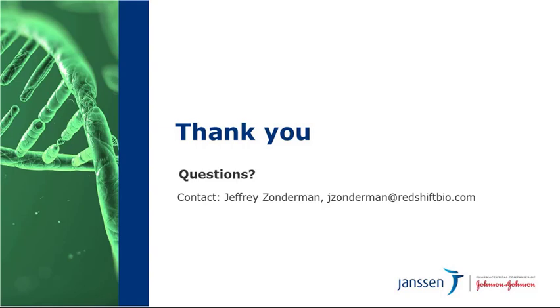Excellent. We have a question from Lou. Have you ever looked if the conformation changes reversed during the neutralization step? Very good question. That's actually the next step after this proof of concept study. So we're expecting delivery of our AQS 3 Pro this month, and those will be the first experiments going on.